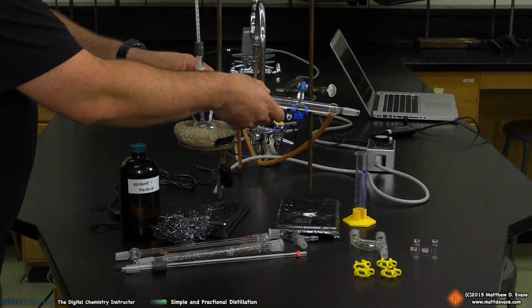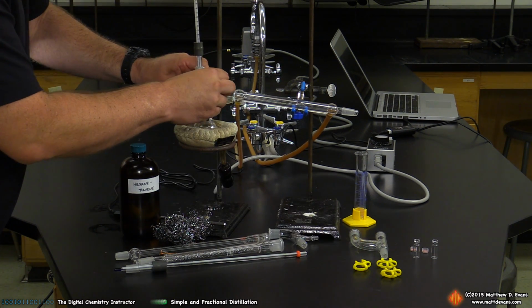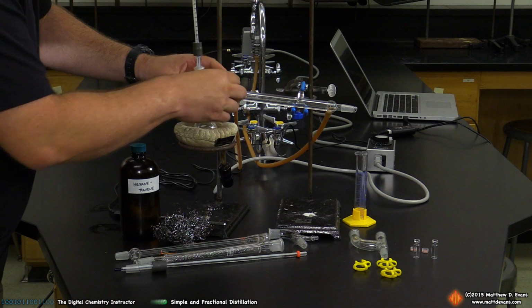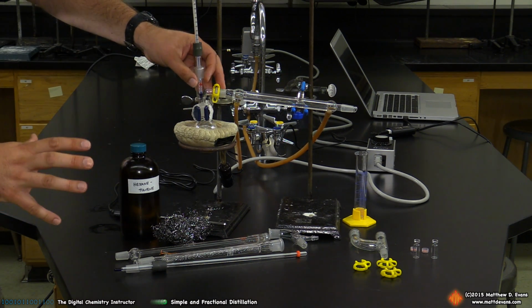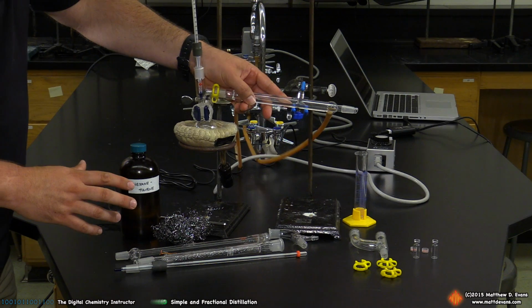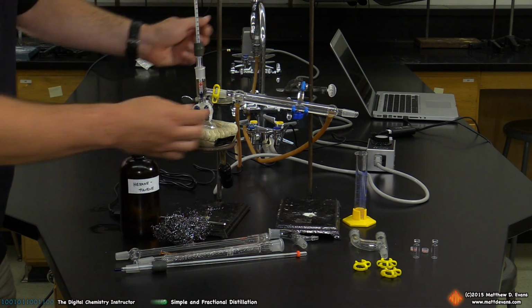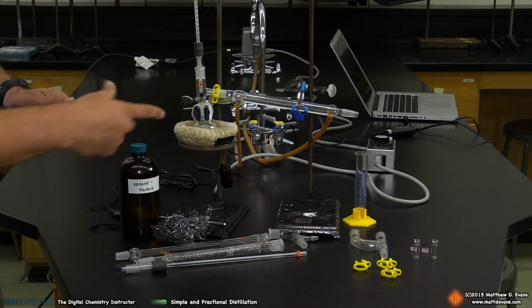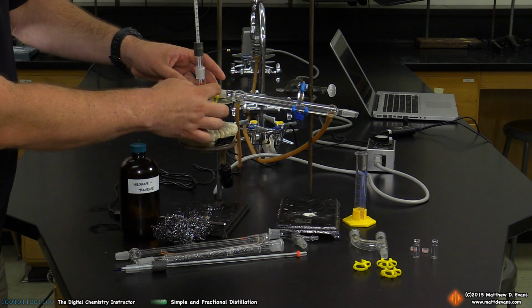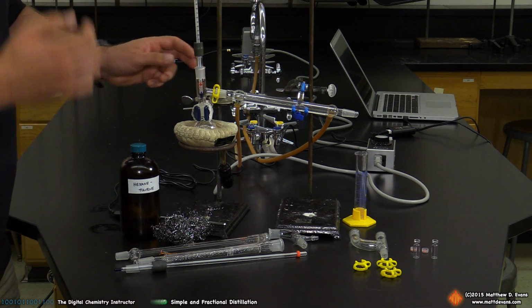The condenser fits on like this. You'll want to use a Keck clamp to hold this in place so it doesn't slide off. Keep in mind too that you don't need a Keck clamp on this lower part because gravity is going to hold the three-way adapter in place on this part of the setup. This clamp right here is simply just to hold it in place. You do not want to clamp this too tightly. It's just there to stabilize the condenser, because if you have it too tight, I've noticed that this will get pulled out of joint and then you've got leaking vapors in the entire distillation setup.